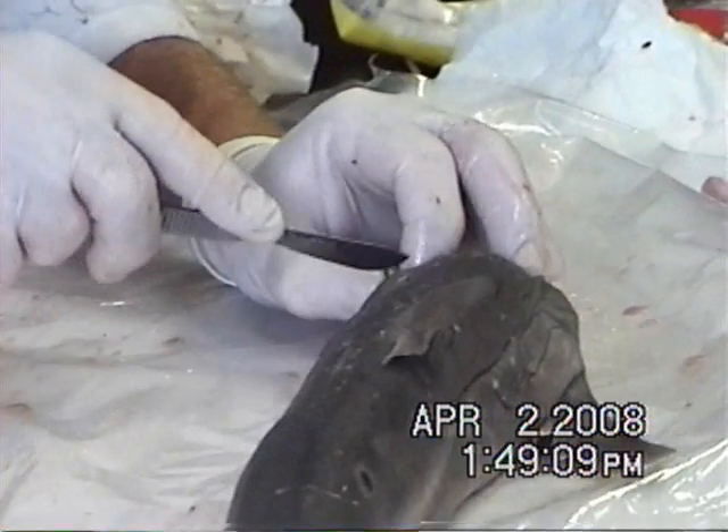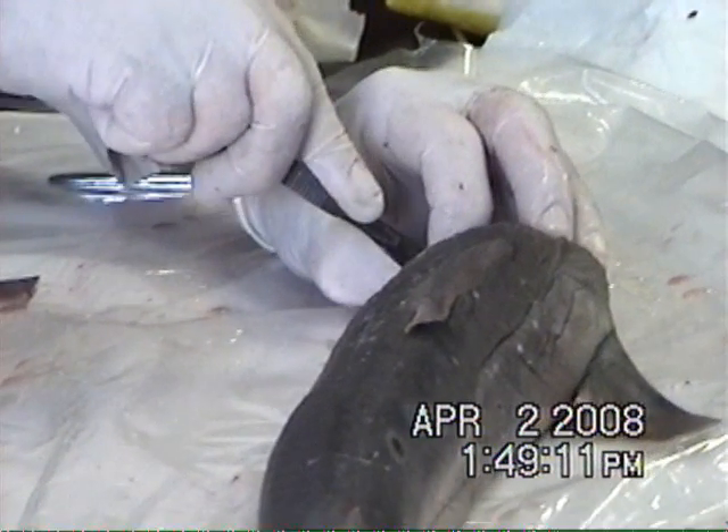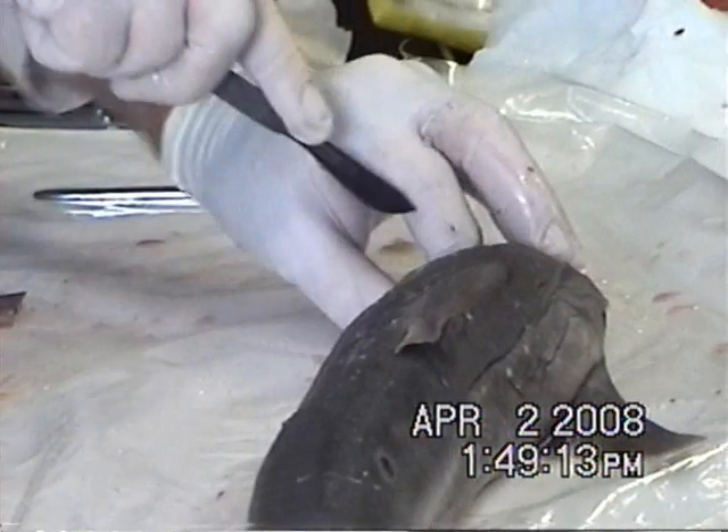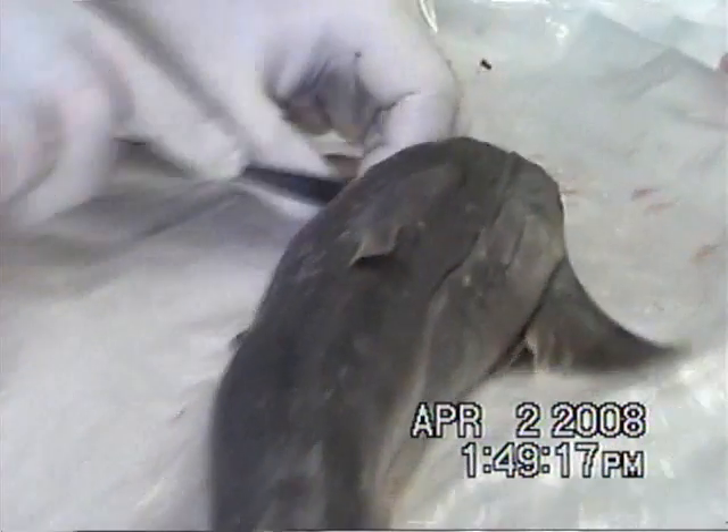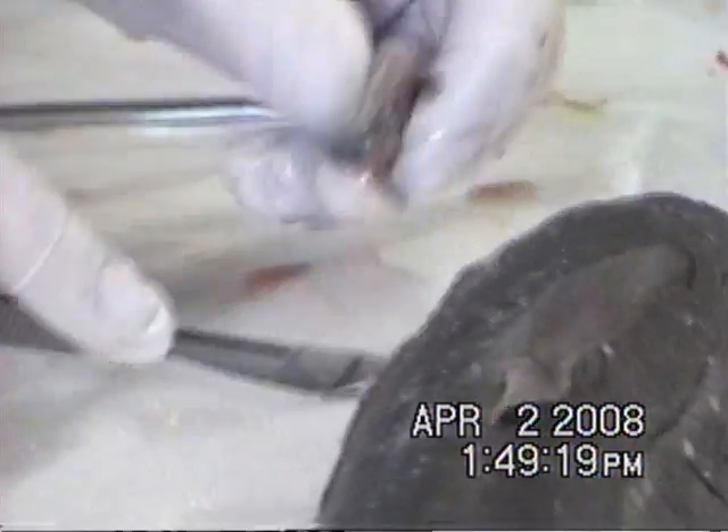The eyeball is like a basketball. The eyeball is now out. Feed it to your snake.